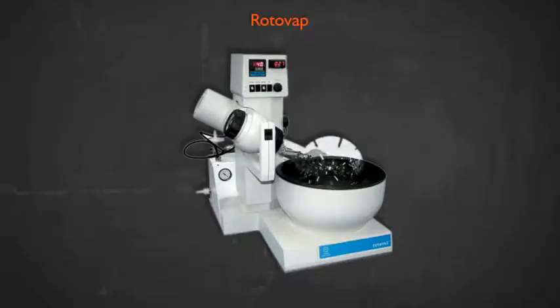And then remember, we have to take that and convert it to a liquid or something that we can carry away. So this is done with the condenser coil. At the top there are these condenser coils which essentially make the temperature in that region much cooler than in the rest of it. If you then cool, you will cause this gas to recondense into a liquid, which is captured at the bottom in the second flask. Oftentimes at the position of the second flask, people put ice around it to keep it cool, to make sure that it doesn't revolatilize.